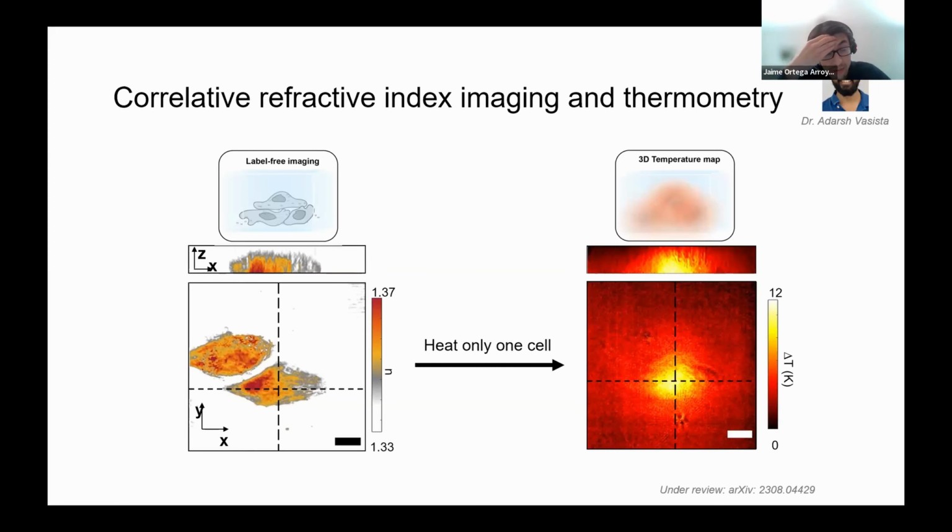But if you look at the recent work of people that are experts in ODT, so you can think of Yong Park, who actually has commercialized this whole optical diffraction tomography, they can deliver video frame rate of the tomograms. So they can do this really, really fast. And the way they do this is they're using DMDs, these digital micromirror devices. So it's about how fast you can acquire these different illumination scans.